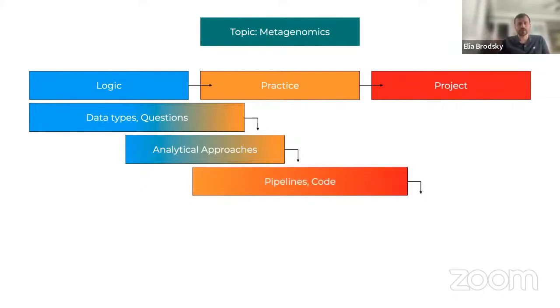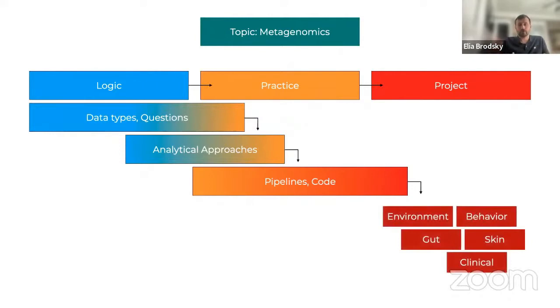So one of them is a standard process, which we call a pipeline, where we take the input files, we go through several different steps, and we get some predefined output. In many cases, that kind of an output requires further investigation. And that is driven both by statistical analysis, visualization, machine learning, and sometimes it's driven by a biological intuition.